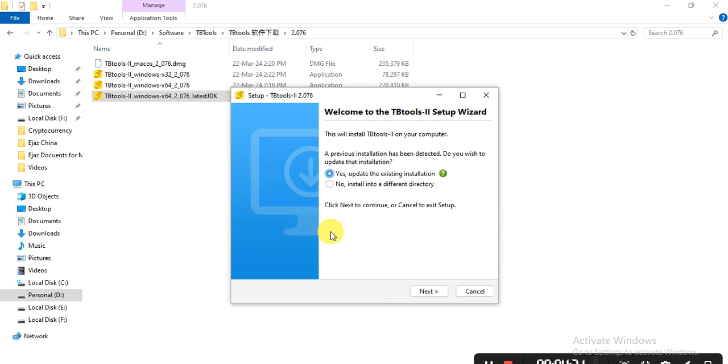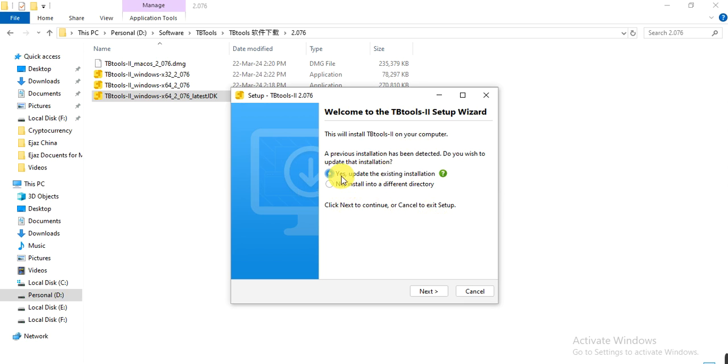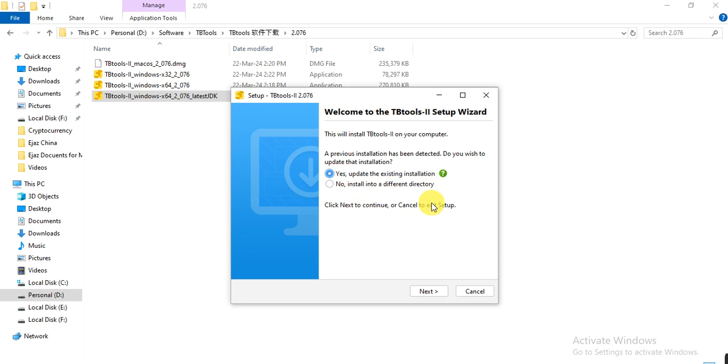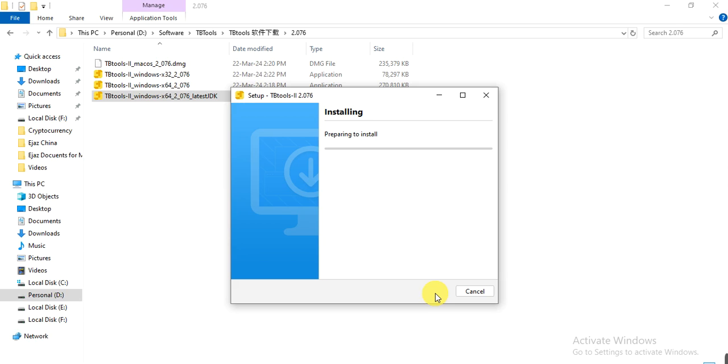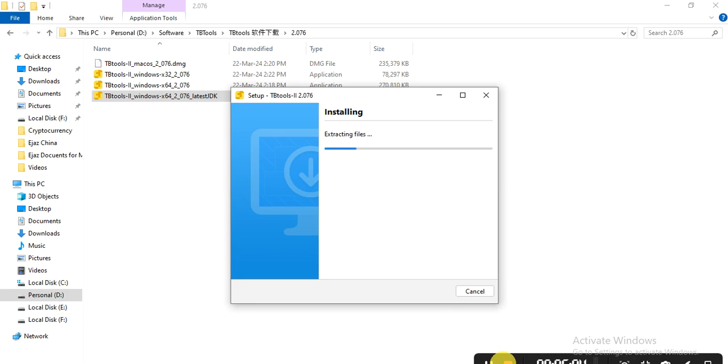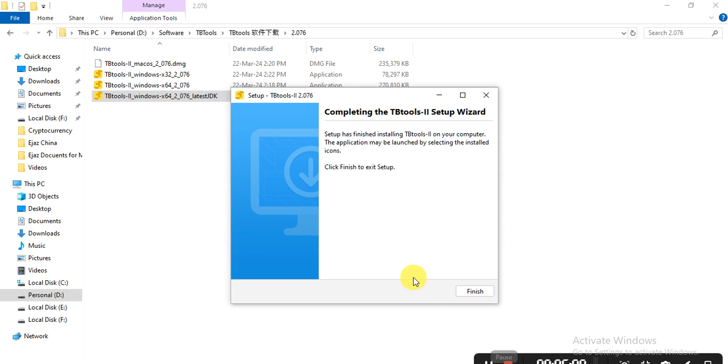I already have TBtools installed, so it is asking me whether to update that version or install new. I want to update, so I click here. If you didn't have it before, you can install it in a different directory. I click next and next. The installation is complete, so you can click on finish.